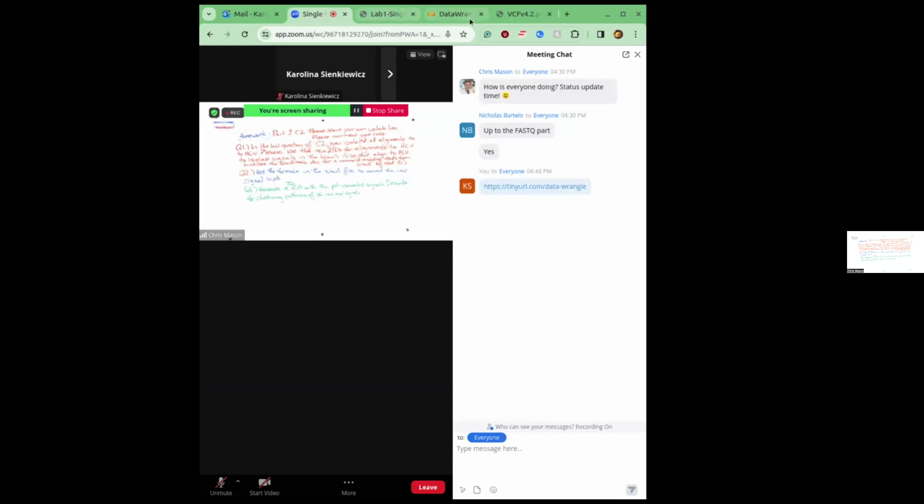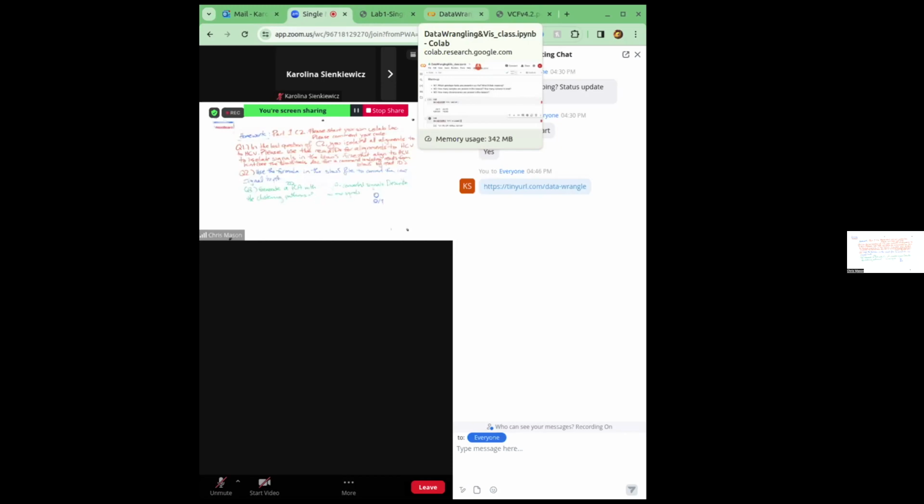Correct? Okay, so if you have a haploid genome, then you would just have one number. If you have a diploid genome, you would usually have two. Even with human datasets, you sometimes can have biallelic sites, and you can have triploidy, etc. locally. So you'll still be able to see how many numbers are here. That's in terms of haploid or diploid.